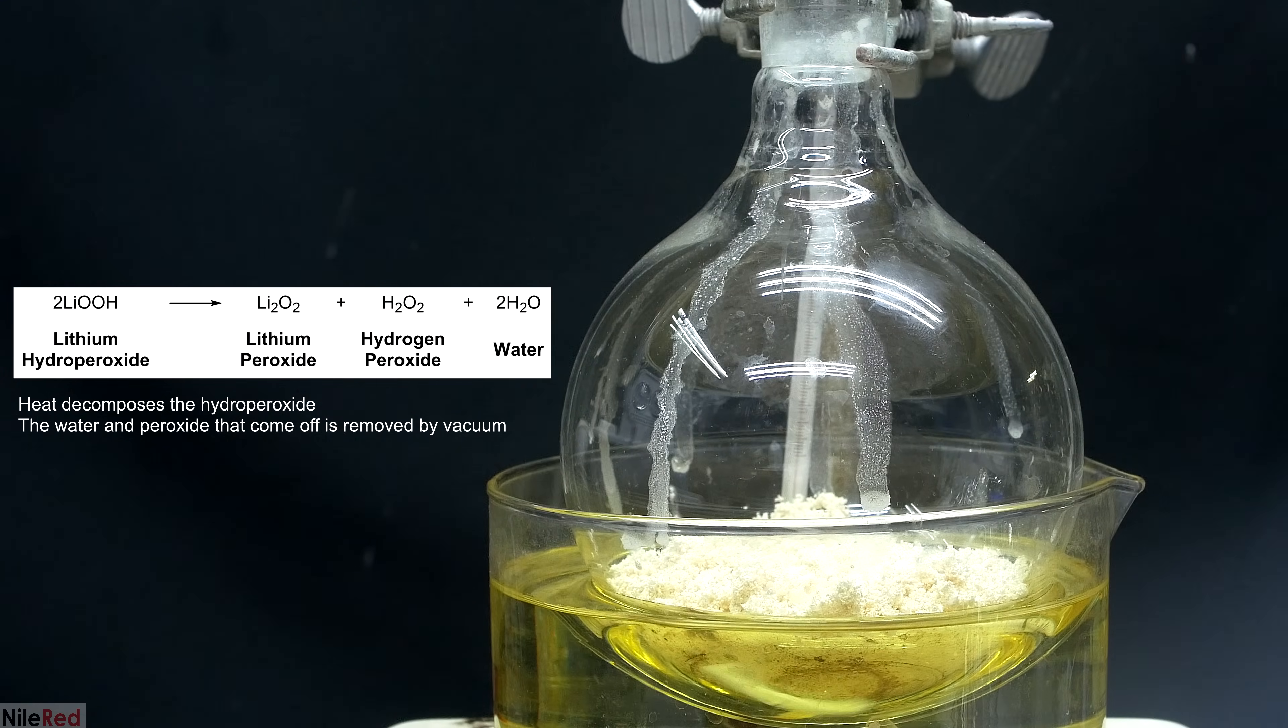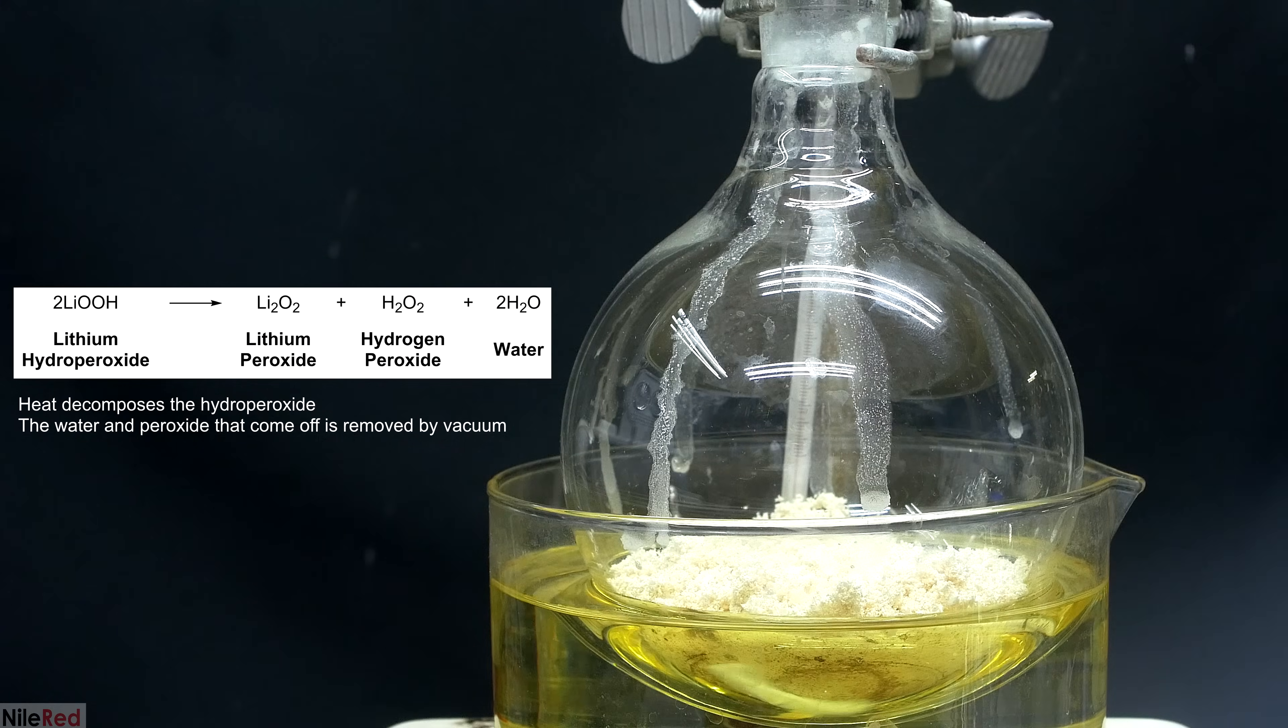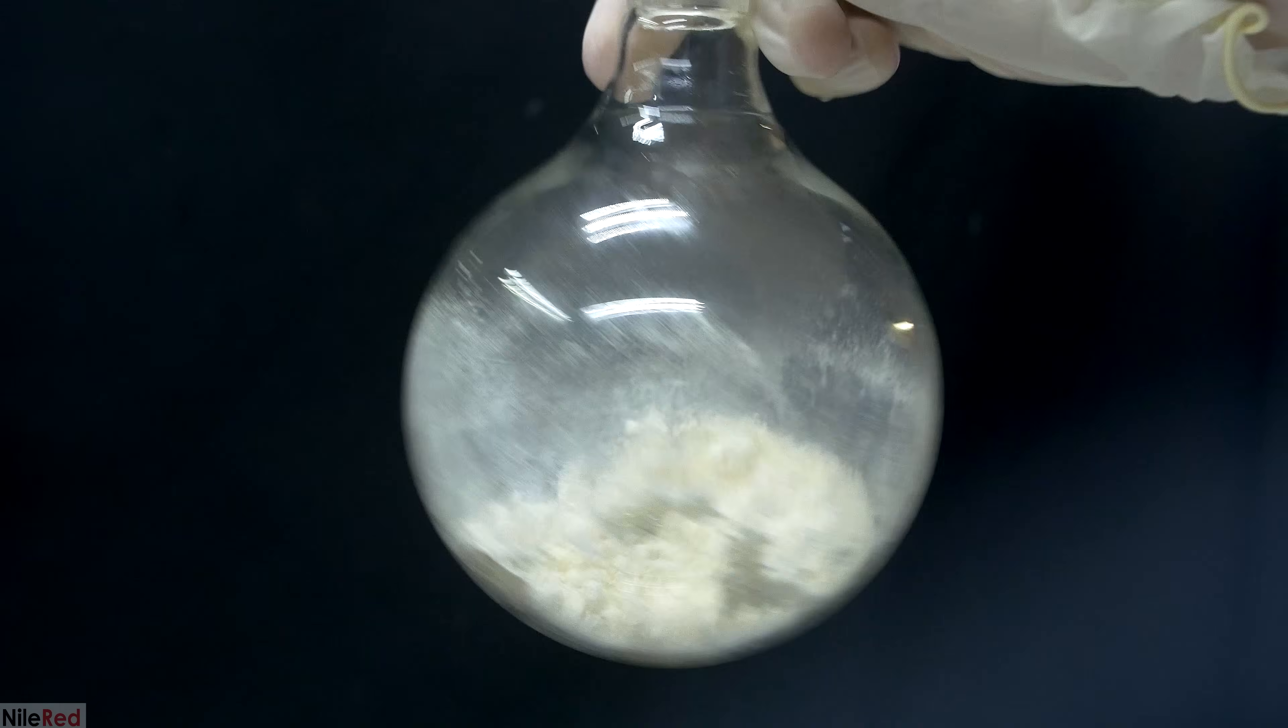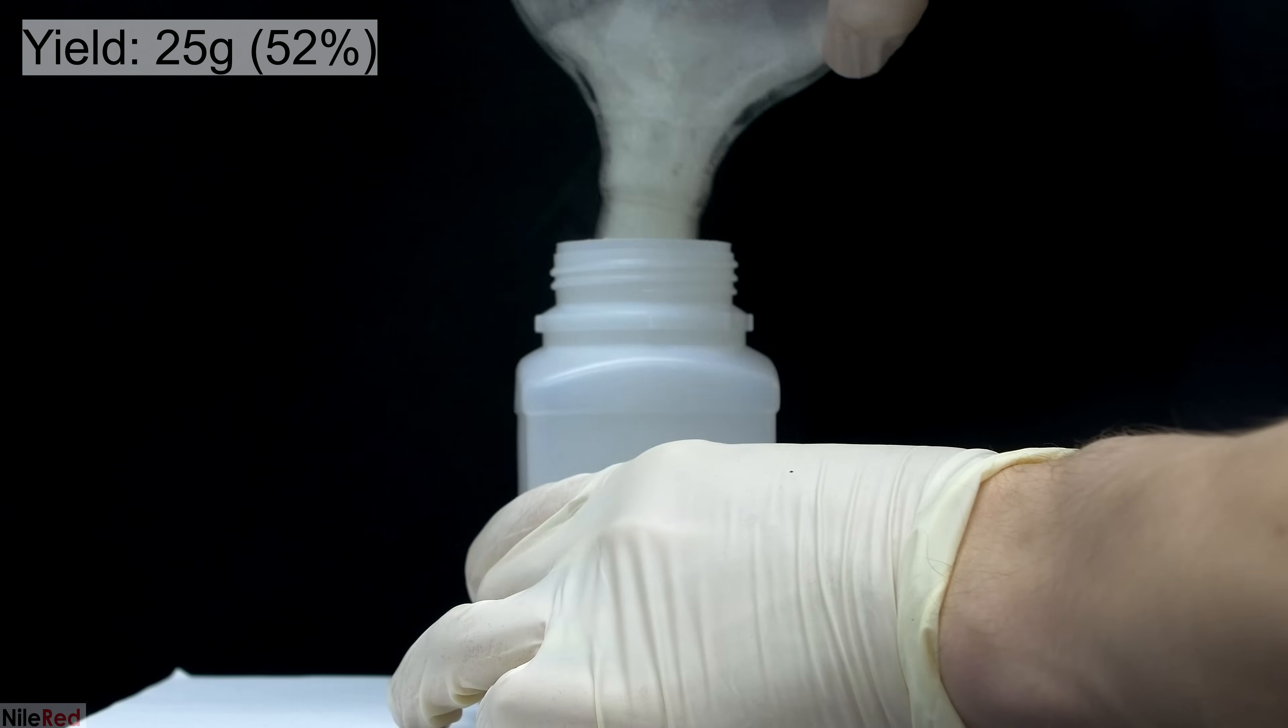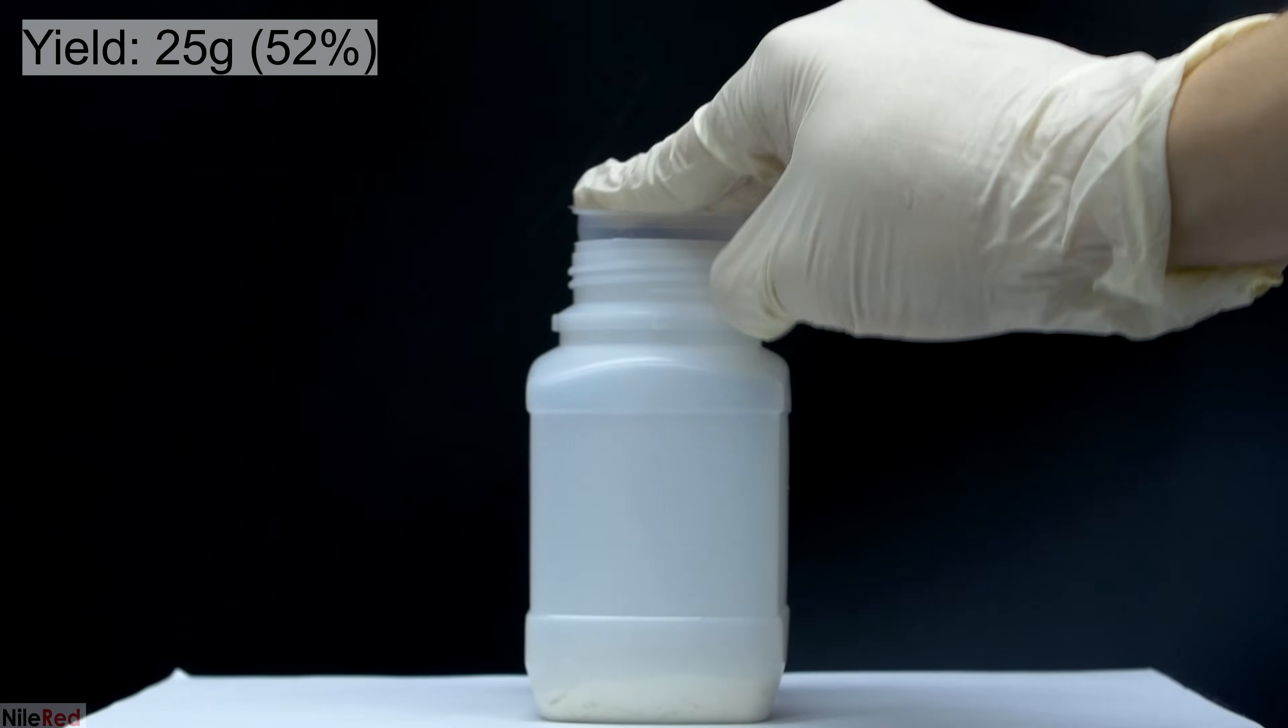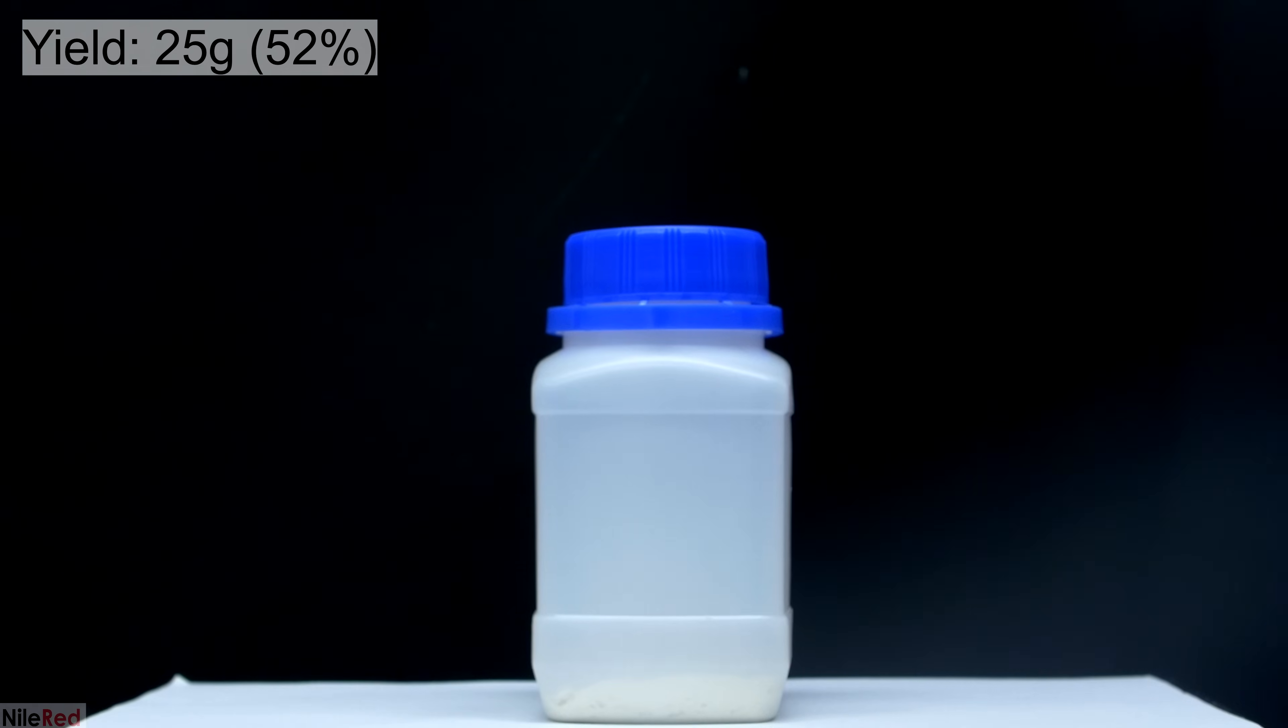This is our setup where the flask is under vacuum and we have an oil bath at around 120C. The dehydration of the hydroperoxide to the peroxide is pretty uneventful and visually not very much happens. I heated it under vacuum for about an hour and when I was done, I was left with a nice dry powder. The lithium peroxide was then transferred directly from the flask to a storage container. The final yield was about 25 grams, which corresponds to a percent yield of about 52%. The patent that I was following advertised a yield of about 83%, so a yield of 52 is a little bit on the low side.